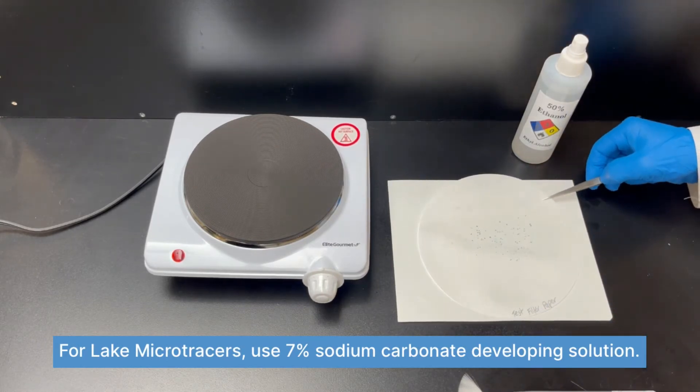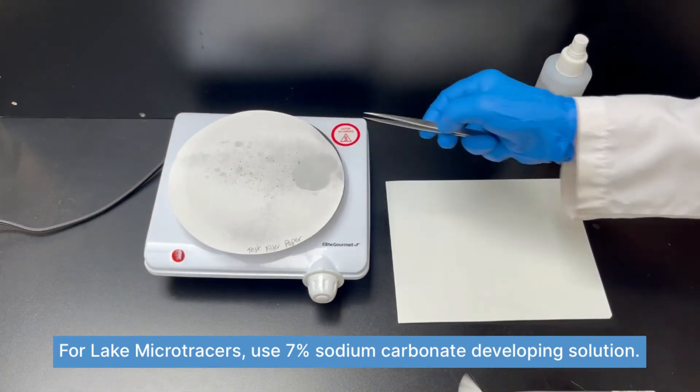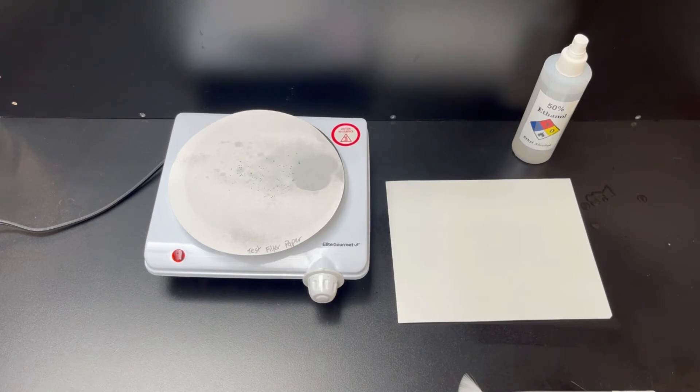Wait a few seconds. As soon as spots begin to develop, place the filter paper onto a hot plate or into an oven. Dry the paper at about 130 degrees Celsius or 270 degrees Fahrenheit. Once the filter paper is dry, remove it from the hot plate or oven.